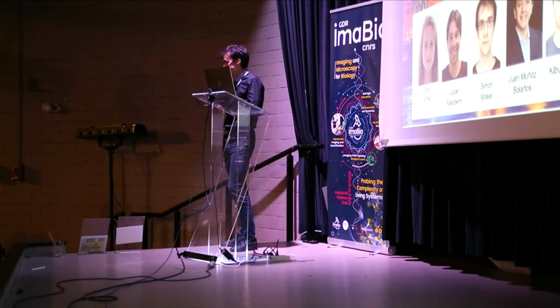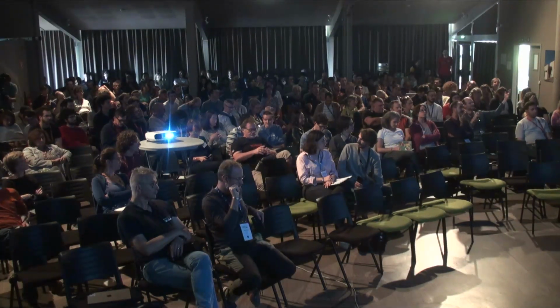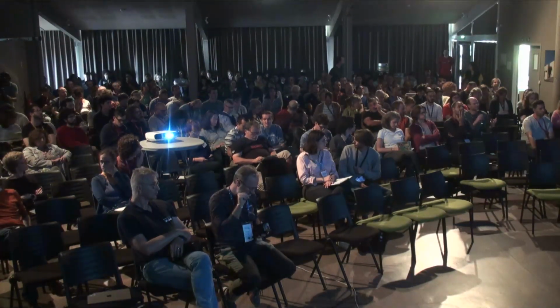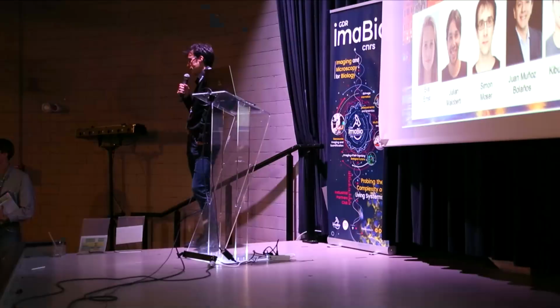Insightful talk. So I'm a bit curious. You want to avoid focus shift inadvertently, right? Because you can accidentally get into this region that's fluorescent and your algorithm goes astray. Now, I didn't really get how you did that. You seem to mention bead measurements, but how do I do that in a sample that I don't really know? I didn't really understand how the correction actually works. How do you ensure that you don't get this unwanted focus shift happening?